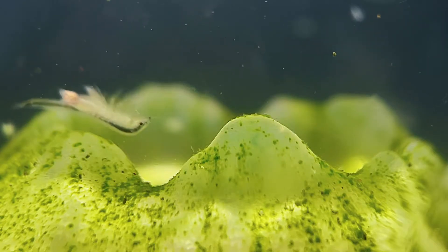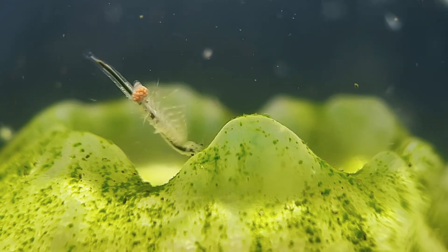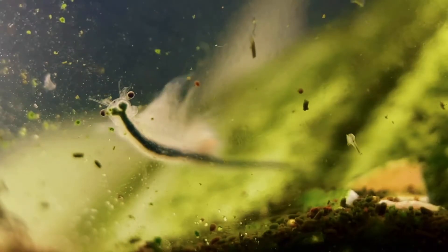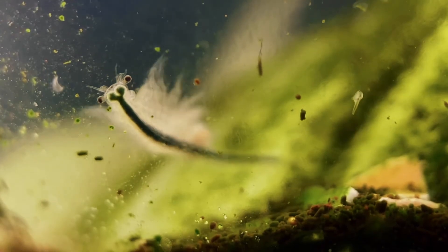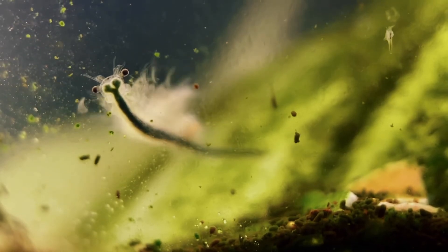Because sea monkeys are almost entirely transparent animals, the gut running the length of their bodies will turn the color of whatever food they've been eating. My adult sea monkeys have been feeding on a few different food sources — both the live green algae growing in their tank and also the different dried algae powders that I feed them — so their color varies depending on what's currently in their system.